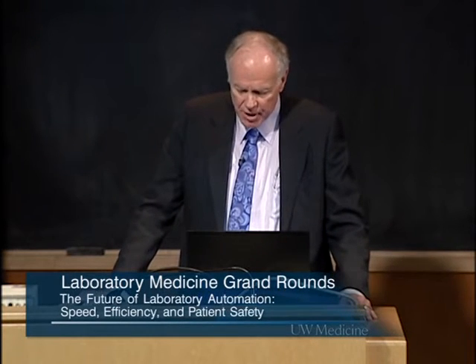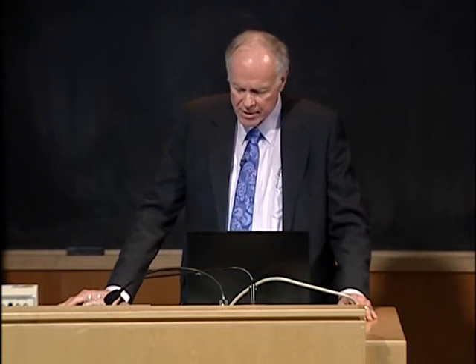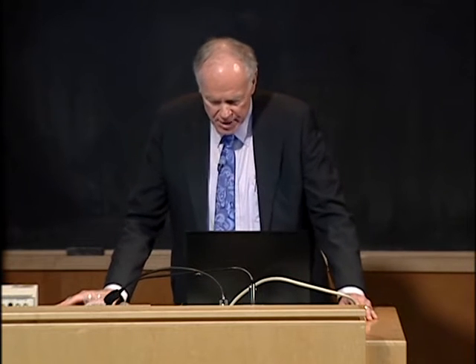This survey was done at a point in time when there were an estimated 525 U.S. labs with automation, about two-thirds of which were total lab automation and about one-third task-targeted automation. And as I showed in the previous slide, that number has more than doubled over the last five-plus years.